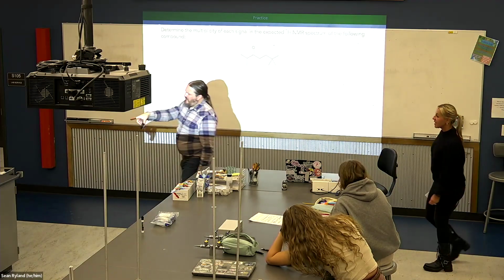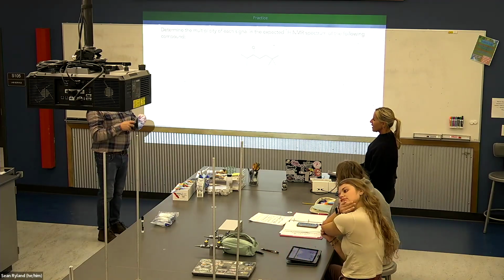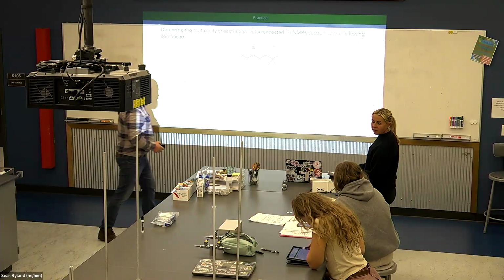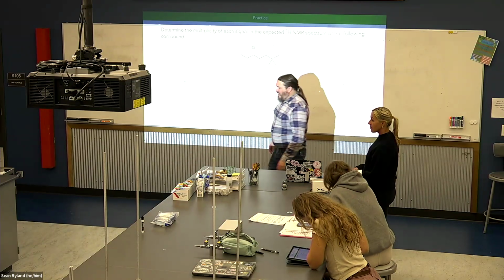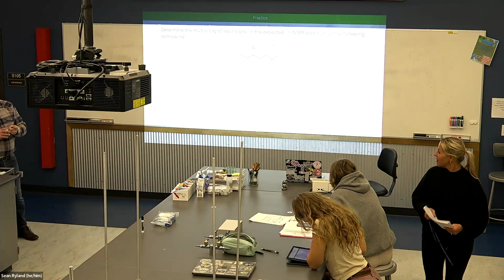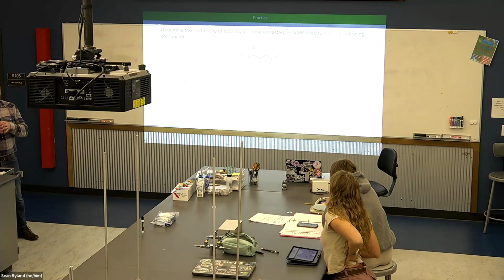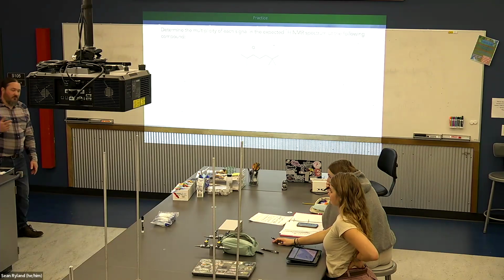And that'd be part of what we use to fill the space. If we had to take one of those that's already compressed and then cut it, then we'd still wind up with the issue of stuff getting around the outsides of it. That's true, yeah. So I think this type of cotton works, and we might even be able to go without. In theory, you can do it without the copper wire. You can just wedge it in there, push it down to where it's all in one spot, and then the pressure with the side would take place more or less. Then we don't have to do anything else.